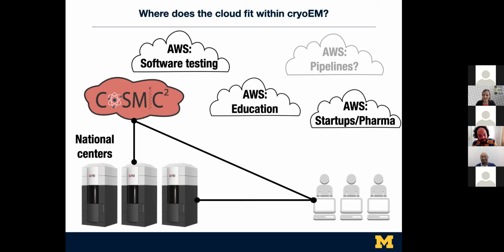It really comes down to where your data is living relative to the fastest internet off of your campus. For anyone out there who has networking problems with cryoEM, the IT group here at Michigan is funded to do networking upgrades and firewall work, but checking that doesn't affect cryoEM data movements. We are actually benchmarking cryoEM data movement patterns, so we can talk about that. That's helpful. So the answer is, it could be as good as 300 megabytes per second. It might be lower.